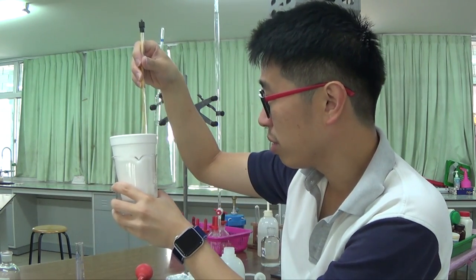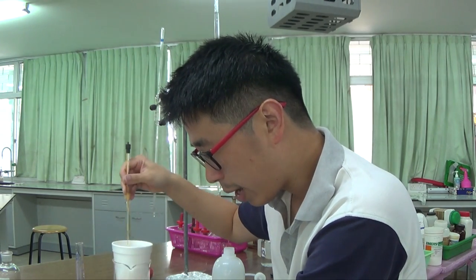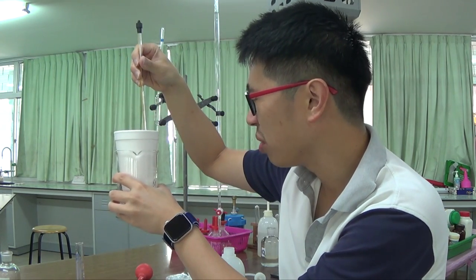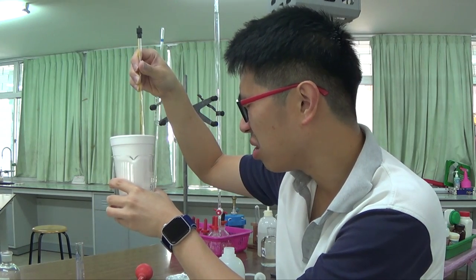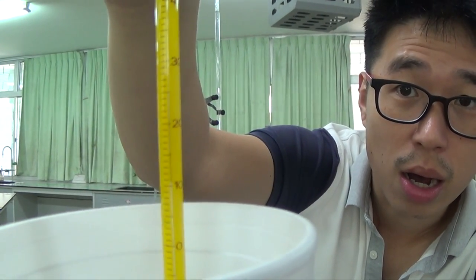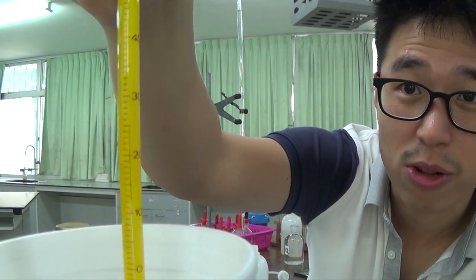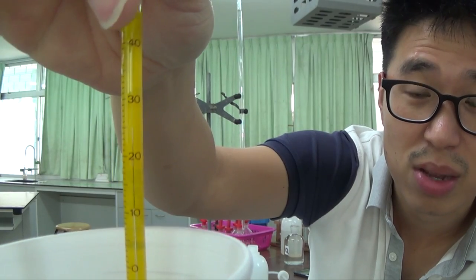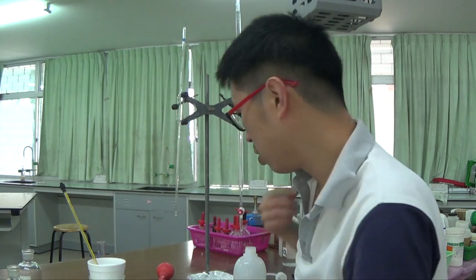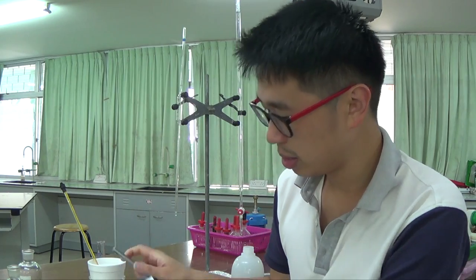So there are 7 temperature readings altogether. They didn't ask us to wait for 1 minute, but I just want to see if it goes up any further. It does not. It stays at 25.0. It is just not very clear, is it? Perhaps you can follow the silvery line here, somewhere there. Okay, it reads around 25.0. Read it to the nearest 0.5 degrees Celsius, so it's 25.0.